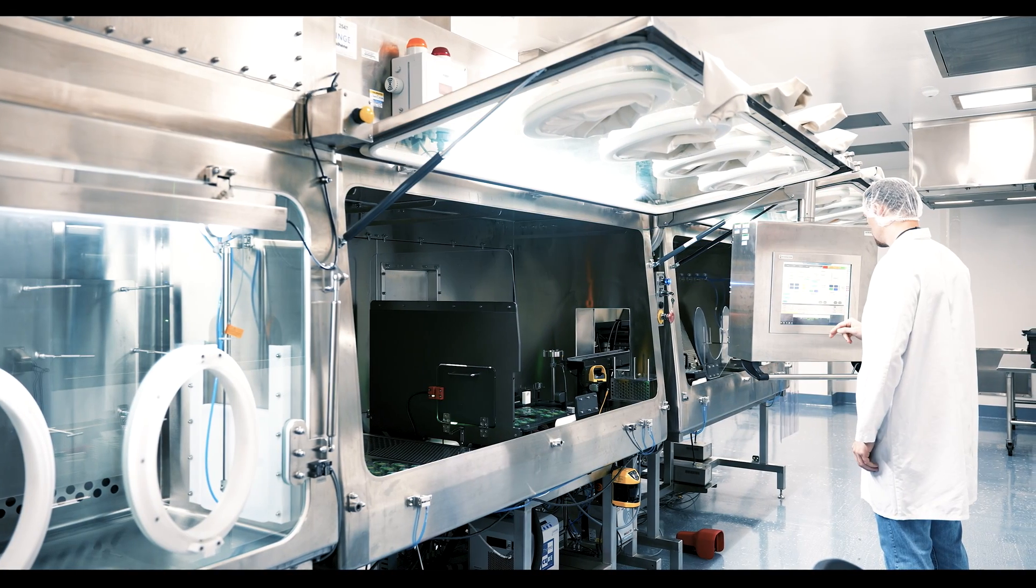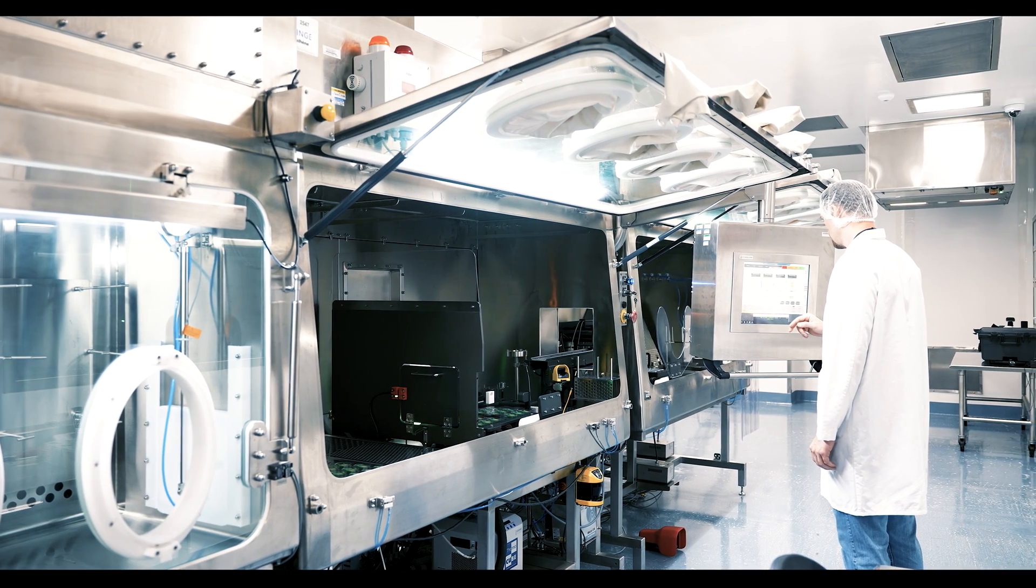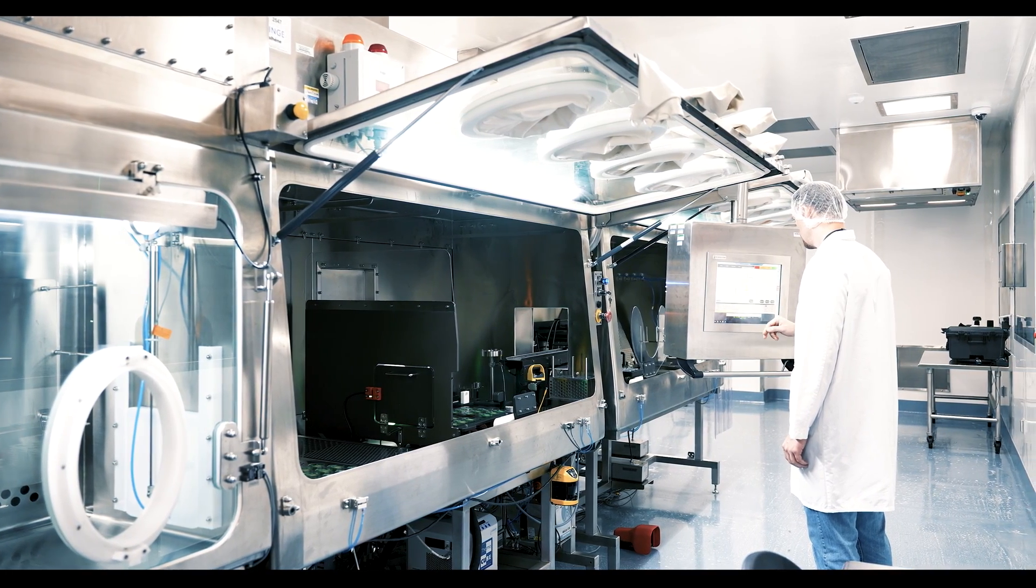The cell's purpose is to dip coat the SMTS device. The parts are introduced to the coating cell after being decontaminated by vaporized hydrogen peroxide.